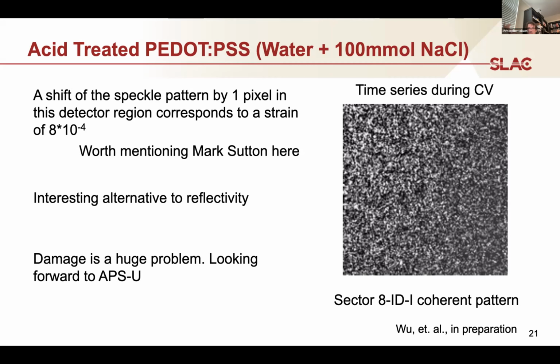And something else we all know is that with XPCS, damage is an absolutely huge problem. Being able to change energy is going to be a real game changer. And the improved coherence should, of course, be much, much better. So I'm looking forward to the APS-U upgrade.